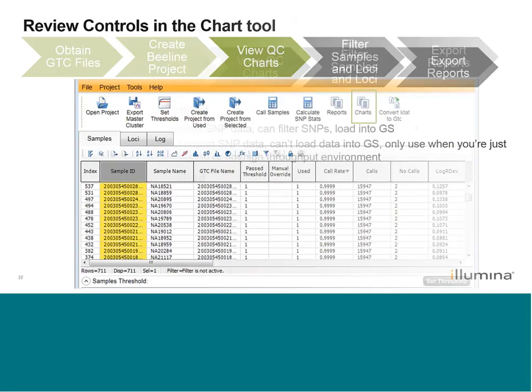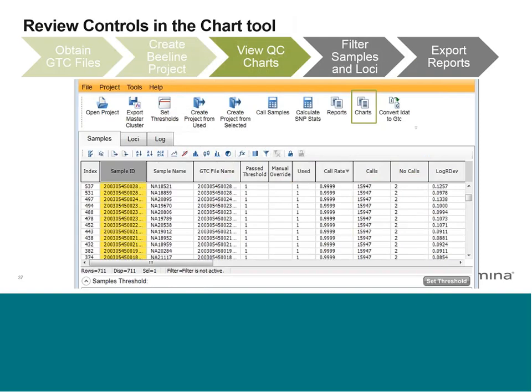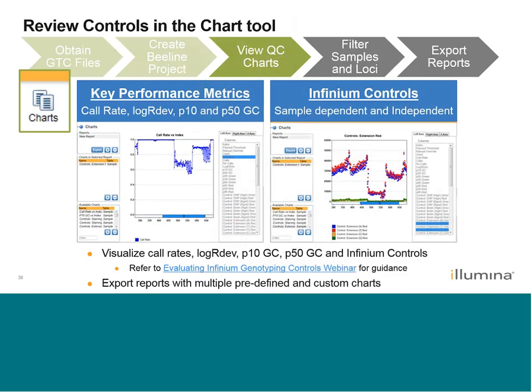Once you've completed project creation, you can move into viewing the QC charts — that crucial step of making sure data quality looks good before progressing to next steps in analysis, verifying that the assay went well, samples look good, and loci metrics are performing well. In Beeline, there is an option to select Charts. Opening that gives you access to pre-filled charts showing call rates, logRdev, and similar metrics over the whole project, but also pre-filled charts with the Infinium controls — both sample-dependent and independent. This is geared towards users already familiar with Genome Studio. If you're not familiar with the controls dashboard, a linked webinar is highly recommended.